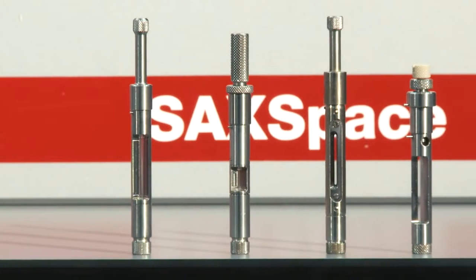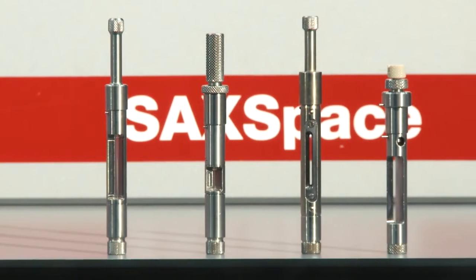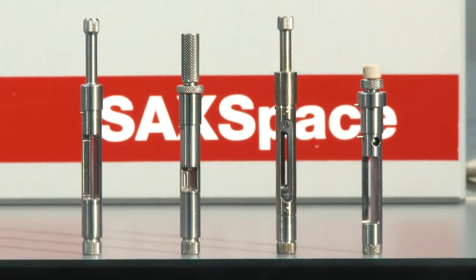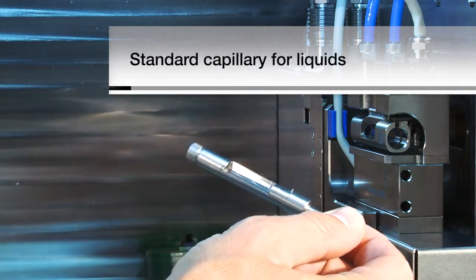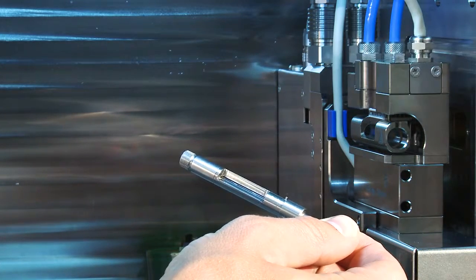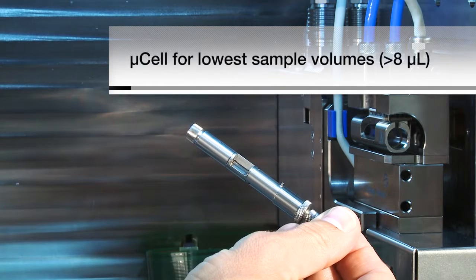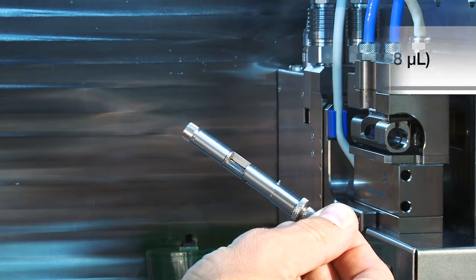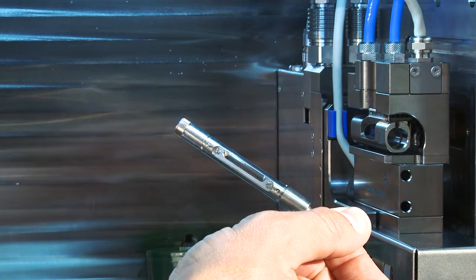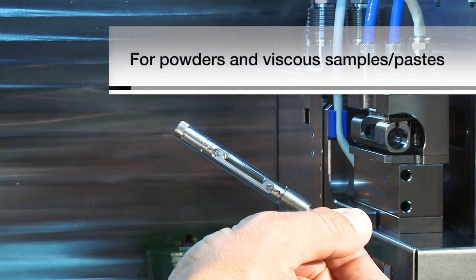Dedicated sample holders are available to measure all your formulations regardless of their state. Liquids are measured in a standard capillary or in the micro cell if you only have a very little sample amount.